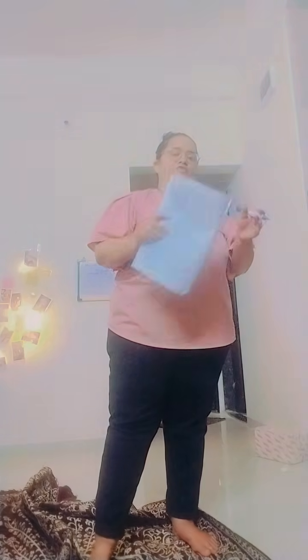Then preparation of the specimen. Contact of the specimen with tap water is prohibited, because if we contact it with tap water, then necrosis may take place. So it should be preserved in what? Normal saline or formalin. Normal saline is fine, so it should be washed in normal saline. Drying damages the surface, therefore it should be kept wet in normal saline only. It should not be kept in saline for more than 2 hours, as autolysis sets in.